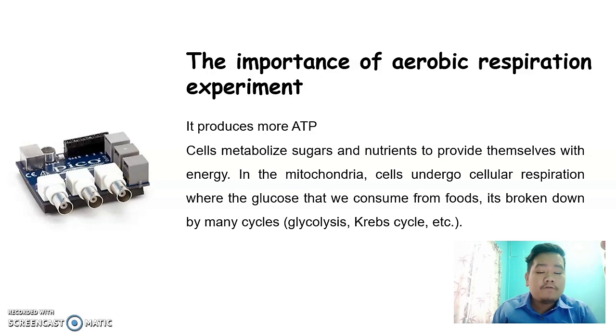And apart from aerobic respiration, this RDAQ can also be used with the pH probe to find the pH of various indigestion remedies and the effect of adding HCl, which is dilute hydrochloric acid.